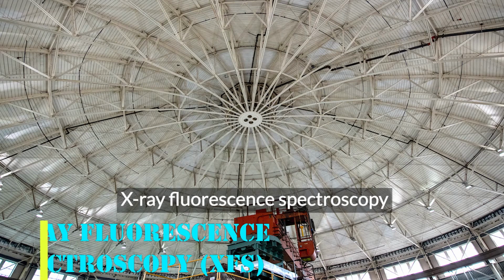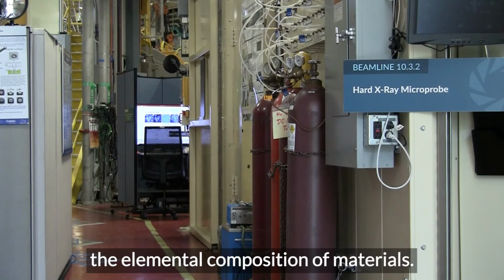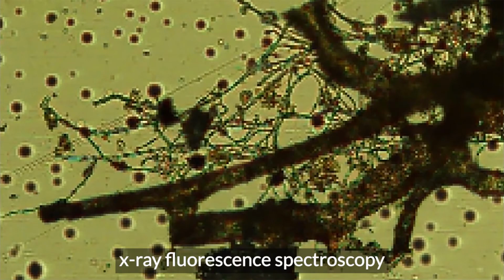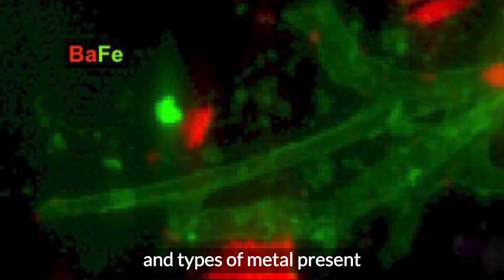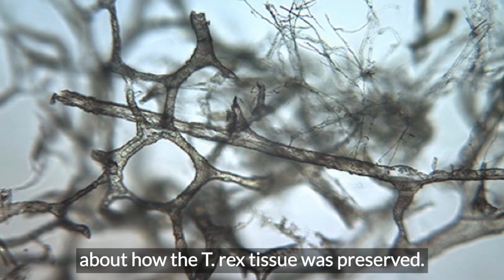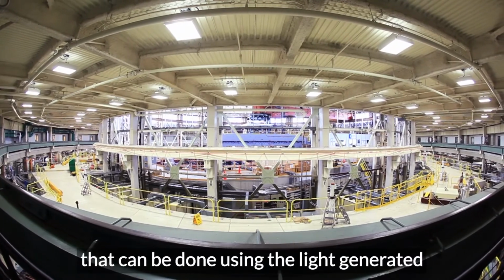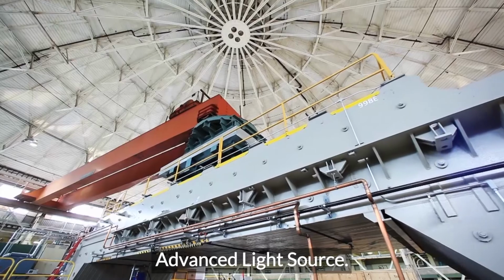X-ray fluorescence spectroscopy specifically uses X-rays for determining the elemental composition of materials. In the previously mentioned T-Rex project, X-ray fluorescence spectroscopy was used to map out the distribution and types of metal present in T-Rex vessels, which helps support the researchers' hypothesis about how the T-Rex tissue was preserved. These are just a few things that can be done using the light generated here at Lawrence Berkeley National Labs Advanced Light Source.